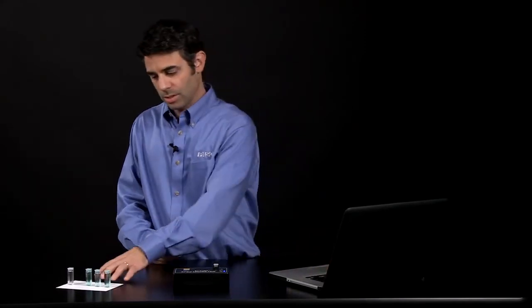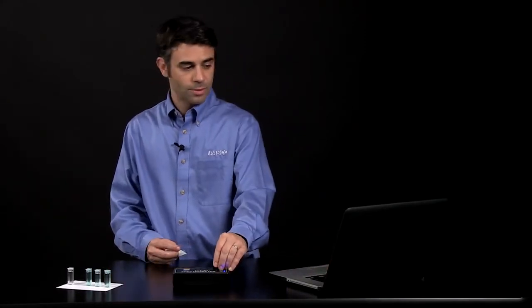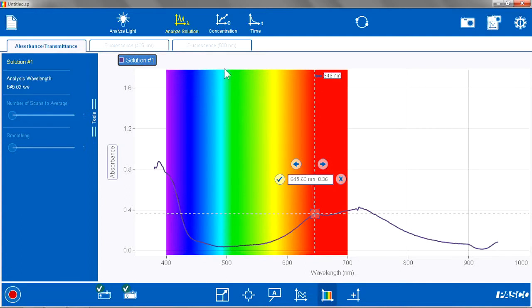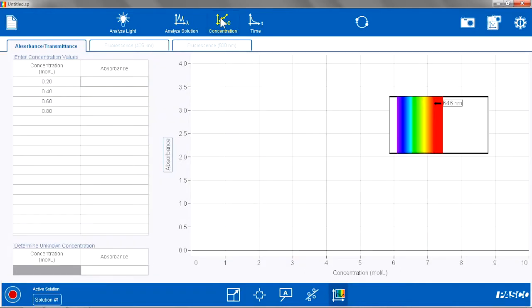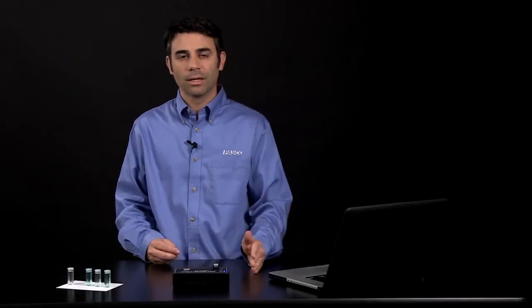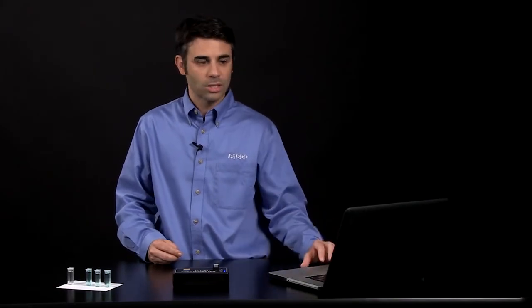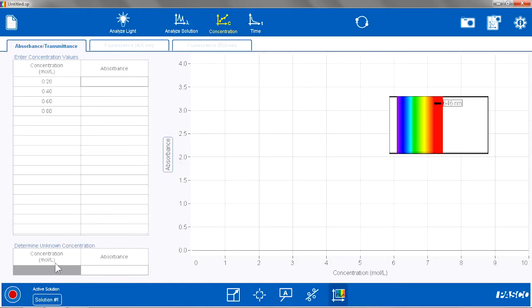Now I am ready to do my concentration studies using my standards, so I am going to go to the Concentration tab in the software. In this tab, it is set up for Beer's Law — I can enter concentration values, it will record the absorbance values, and I will see a live scan of the full spectrum of absorbance from 380 to 950 nanometers. I will be able to determine the unknown concentration using a separate table. To get started, I am just going to hit Start.